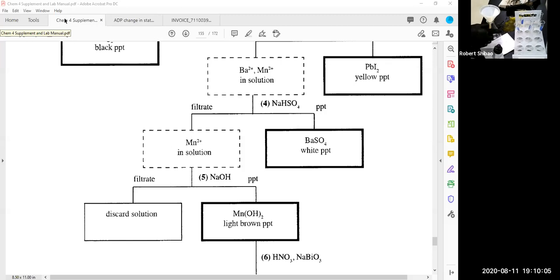Shoot. Another thing you've got to worry about are fatigued test tubes. That is, people stir these, including me. I was stirring this, and as I was stirring it, it punched a hole into the bottom of the test tube. Do you guys see that? Probably not. It punched a hole into the bottom of the test tube. So unfortunately, my solution is now all over the counter. It's too bad.